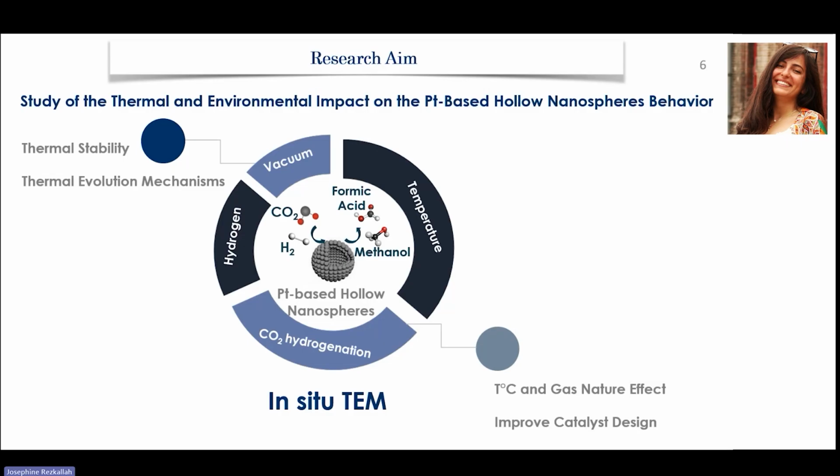To achieve this, we've used in situ and operando transmission electron microscopy techniques. This approach will allow us to have real-time monitoring of both the morphological and compositional changes in the nanospheres during the chemical reaction. We also focus on how temperature variations and gas composition can influence the overall thermal stability of platinum-based nanospheres.